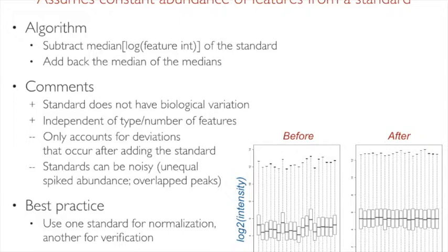And usually a lot of these artifacts occur not at the mass spectrometry stage, but much earlier. How the samples were stored, how they were collected, how many freeze thaw cycles, enrichment. Ideally, you would have a standard very much upstream, which would actually account for all of that. And that's much more difficult.